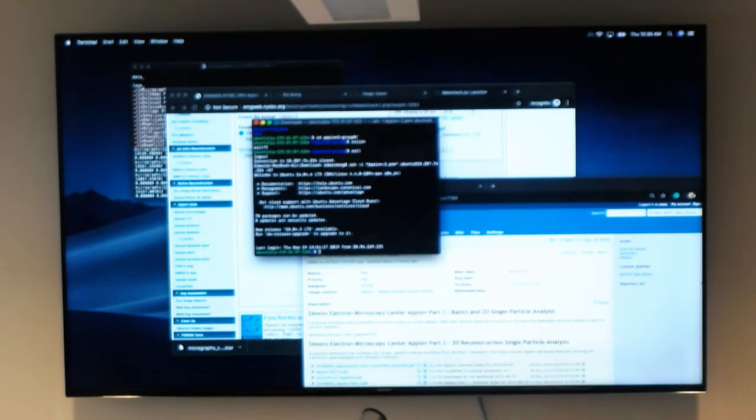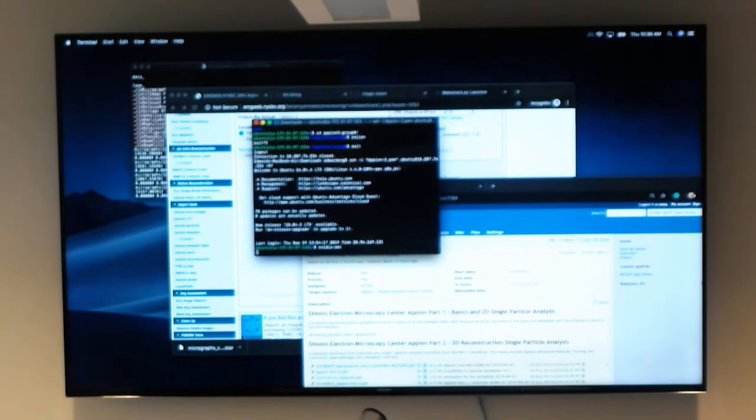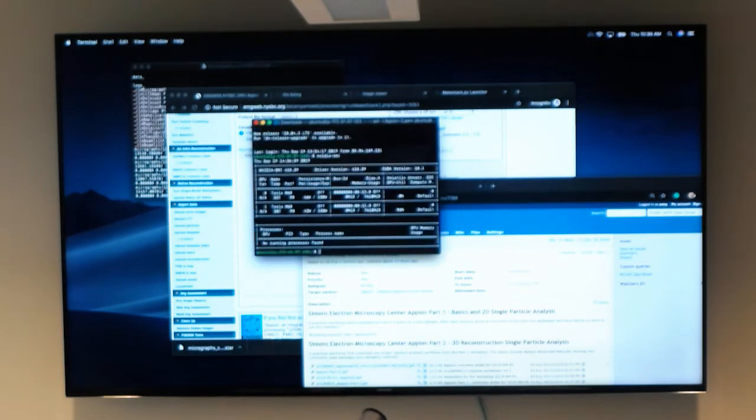So what is here? Well, we have an instance with 2 GPUs. They're Tesla M60s, and I believe for every GPU you have 4 CPUs, or do we have 32 CPUs? So we'll double check how many CPUs we have, but right now we have 2 GPUs.